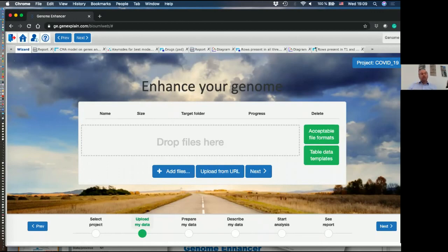But more and more data are coming now from single cell transcriptomics and also on COVID-19. Our goal is we start analyzing also single cell data. And maybe in some next webinars, we can present data from single cell analysis when the sample is disintegrated into different subtypes of cells, and each subtype can be analyzed through this pipeline, and then at the end, results of different analyses are integrated in one response.